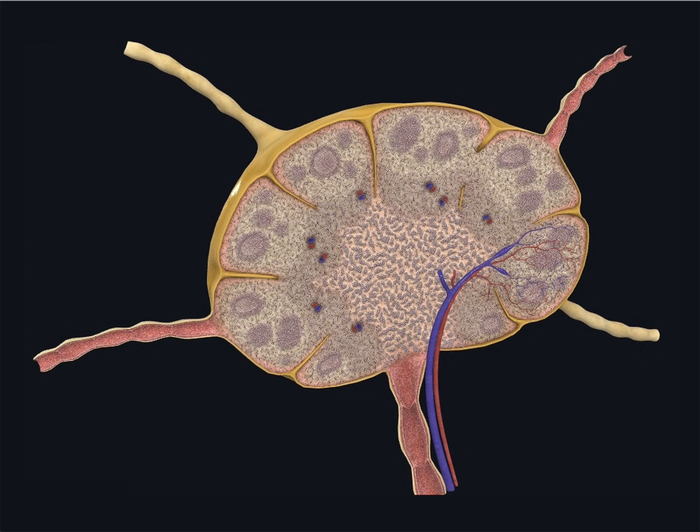I'll explain that a lymph node is divided into a cortex and a medulla. And you can see that lymphatic nodules are found in the outer part of the cortex, and the paracortex is a region in the inner cortex not occupied by lymph nodules and contains most of the T cells in the lymph node.